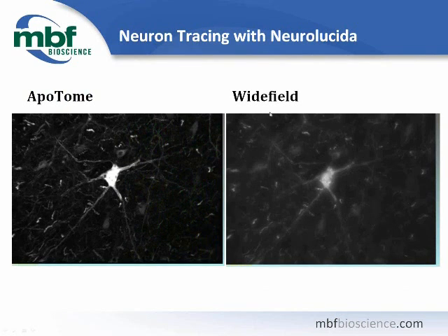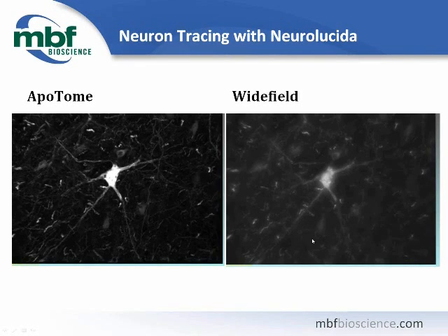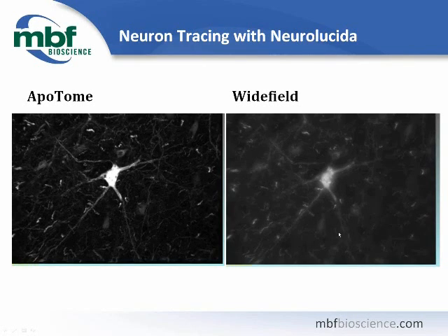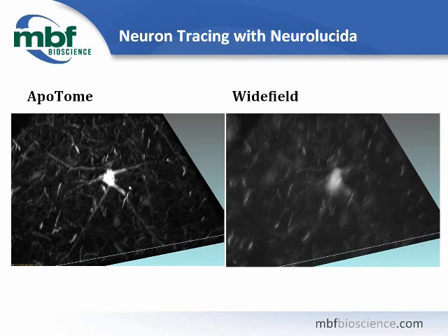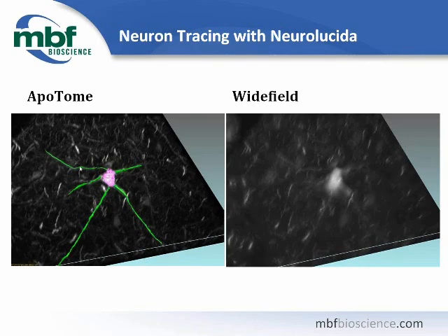Now that you have Apatome images and image stacks, how does that affect your data collection? In Neuralucida, if you're doing neuron tracing, here's an example of a neuron imaged with the Apatome and in wide field mode. In the maximum intensity projection, many of the same structures are visible in both images. But when you look at the image volume, a lot of clarity goes away in the wide field image — tracing through Z is quite difficult. The clarity obtained by removing out-of-focus light with the Apatome can make reconstruction much easier, either manually or using AutoNeuron in interactive mode to trace the soma automatically and then interactively trace the dendrites.